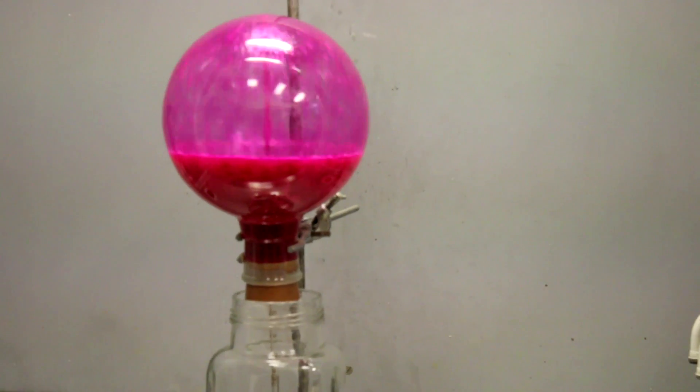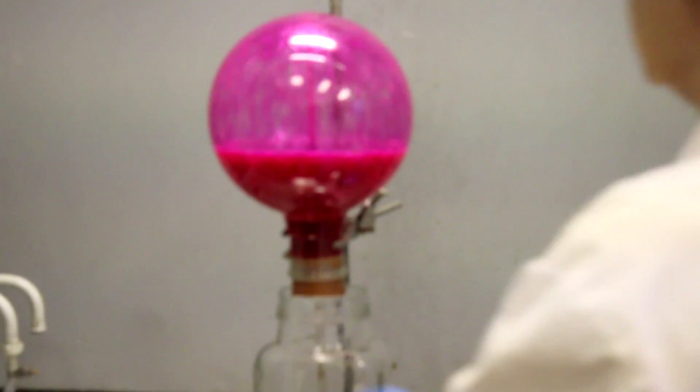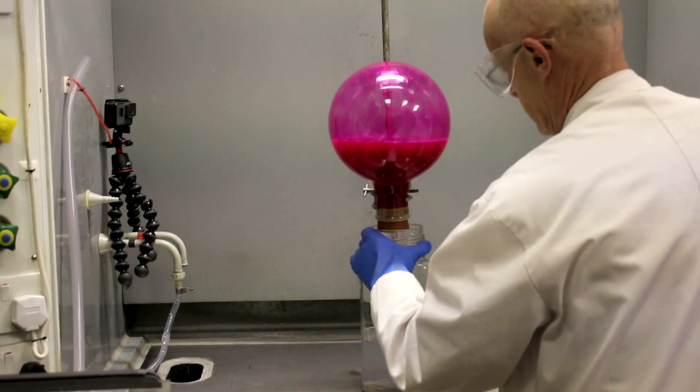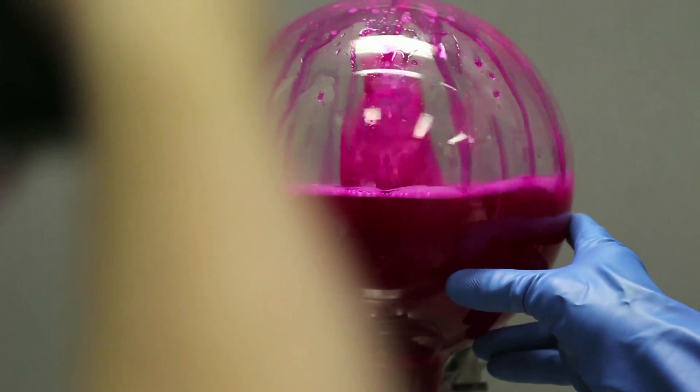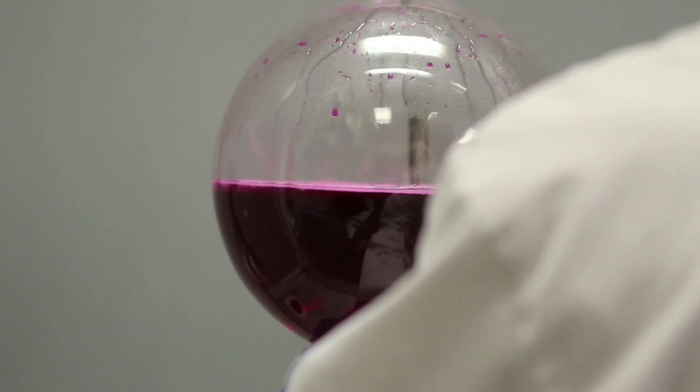Before we go on to the next one, just let me remind you: the reaction here is ammonia dissolving in water, making it slightly alkaline. The red color is not part of the reaction, but it's an indicator to show you that the water is alkaline.